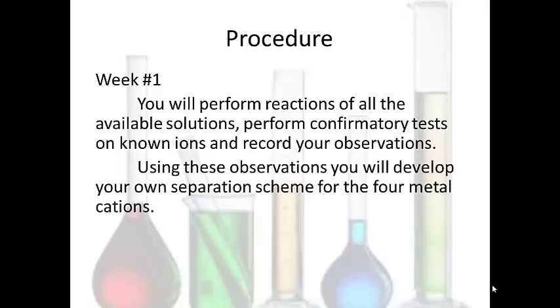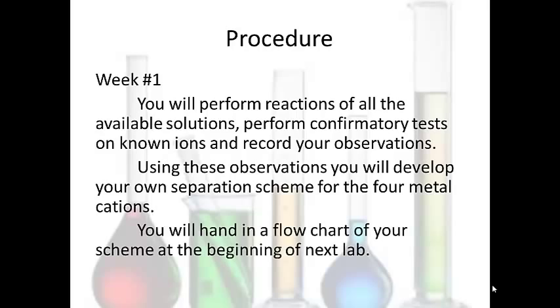Once you have these observations, you will use these to develop your own separation scheme for the 4 different metal cations provided. You will then need to hand in a flow chart of what your separation scheme is at the beginning of the next lab.